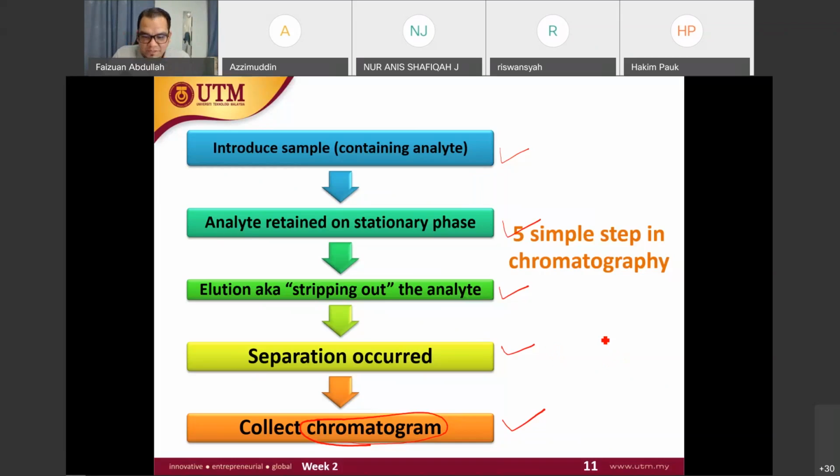The result will be in the chromatogram, but still, for this chromatography technique, we need to calibrate, because the instruments are what? I want to hear from all of you. Stupid. The instruments are stupid. Because we create the instrument, it is not so clever, not so good, not so smart. So we need to teach the instrument, and we teach it from the calibration, the calibration plot.